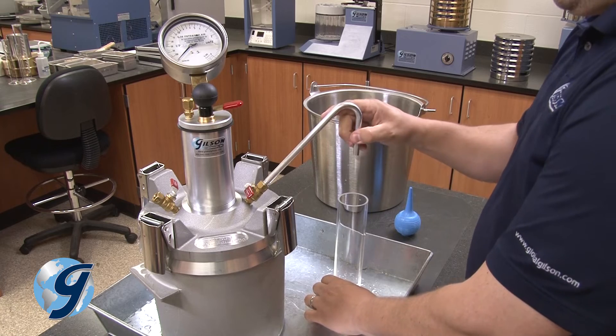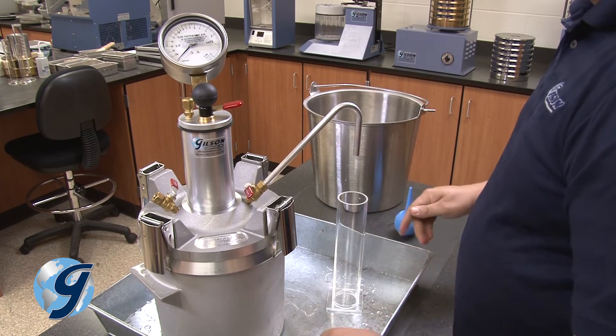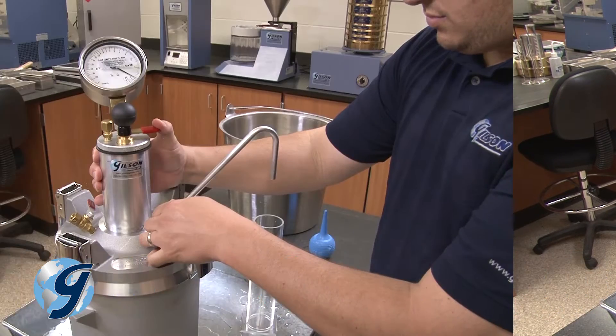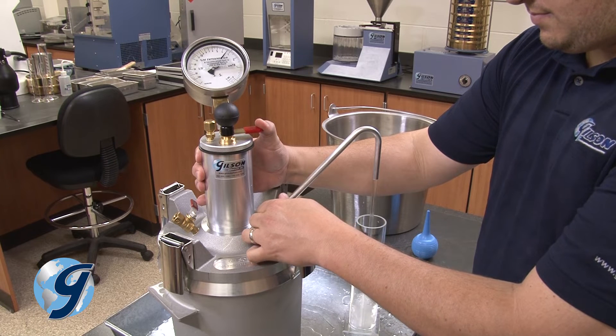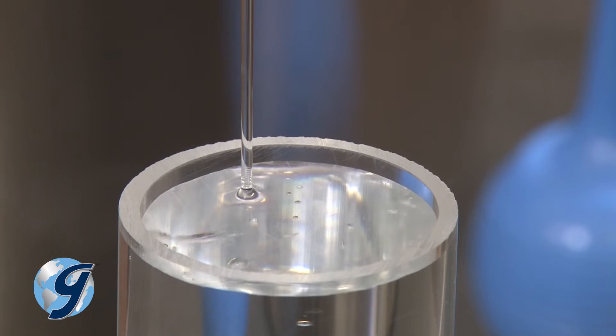Now, place the empty calibration vessel directly under the bent tube. Next, open the bent calibration tube petcock and slowly press down on the needle valve lever to fill the calibration vessel completely full of water.